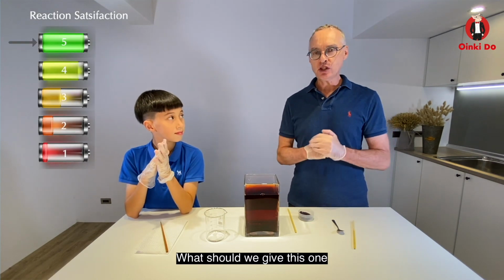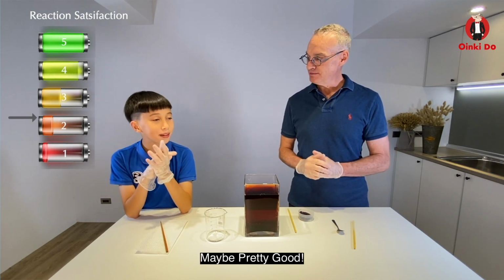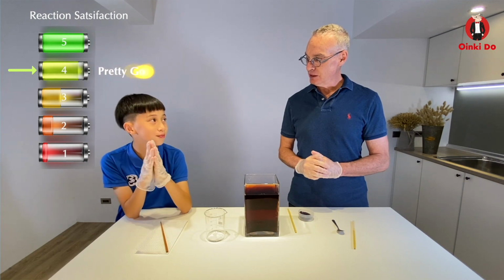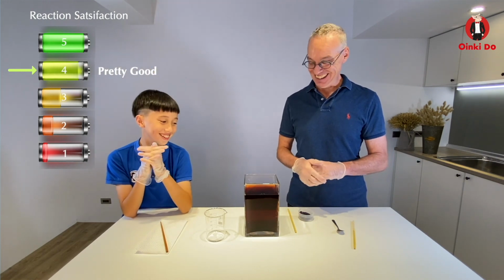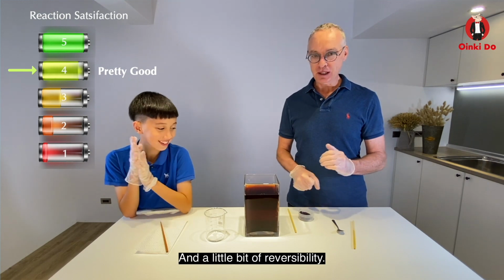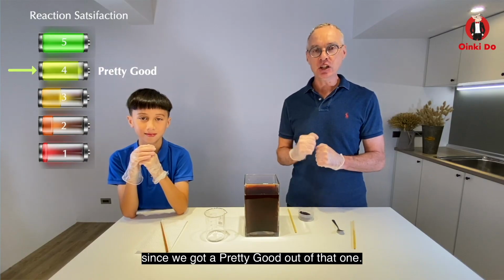What do you think, Ting? What should we give this one for our reaction satisfaction score? Maybe pretty good. Pretty good? Because we like the colors, there's no diarrhea color in there. All right, and a little bit of reversibility. All right, how about we prepare for the next redox reaction since we got a pretty good out of that one.